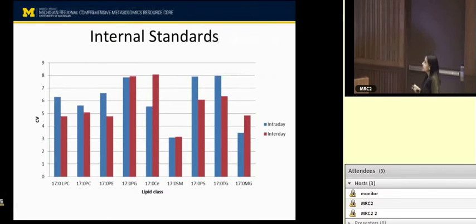The pools here, our test pools, are in the center, and they're pretty good. We see slight drift in one of the samples, but all of them are pretty good. That's what we expect to see. Our human plasma is right here outside, and all these are rat plasma. Since we ran all these samples together, experiment 1 and experiment 2 that I mentioned, we normalized all of these samples together.